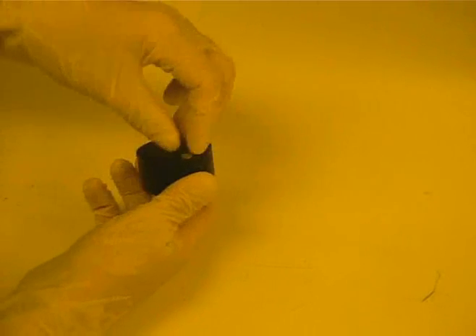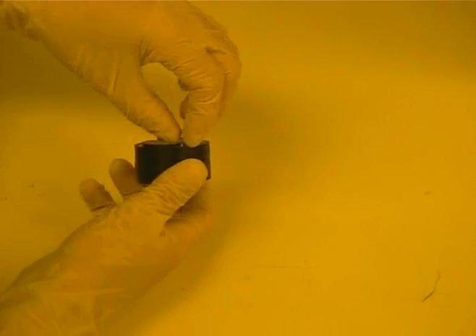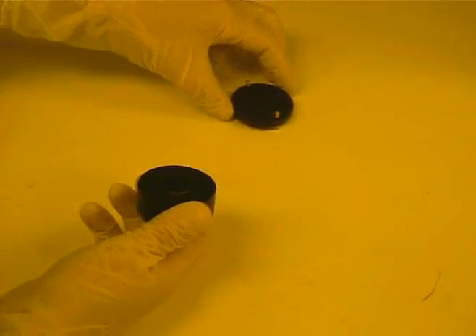To remove the cover, twist the screws. A point will come when the screw will lift up. The lid will capture it. This prevents the screws from being lost. Be sure to place the lid face up. This will prevent any contamination from coming in contact with the lid.